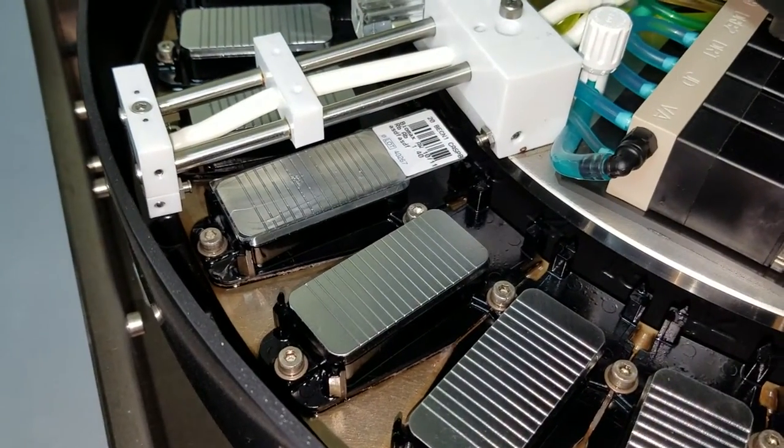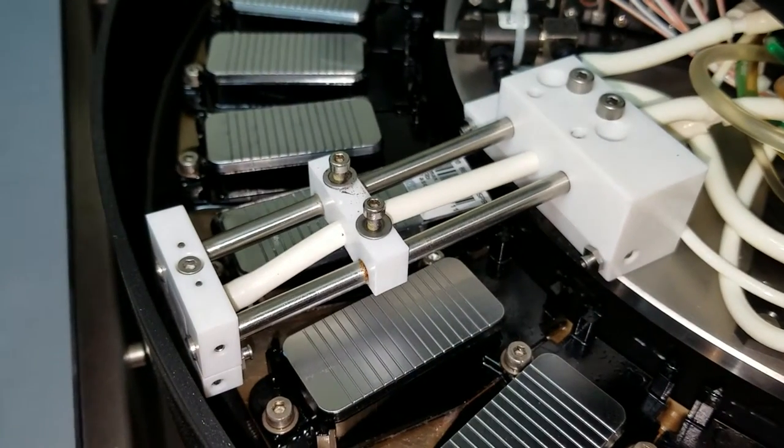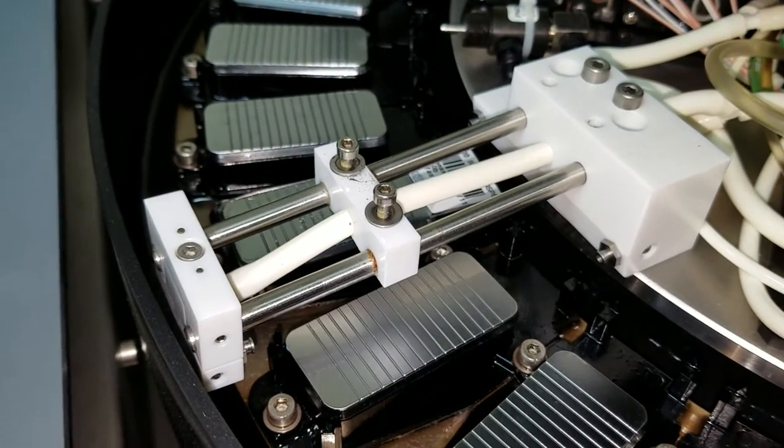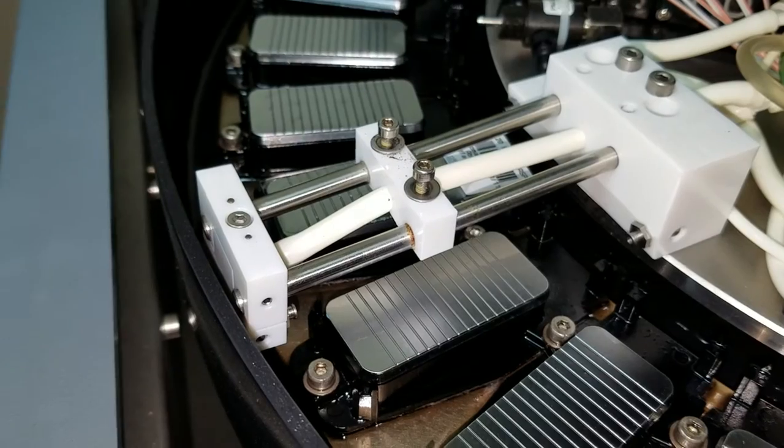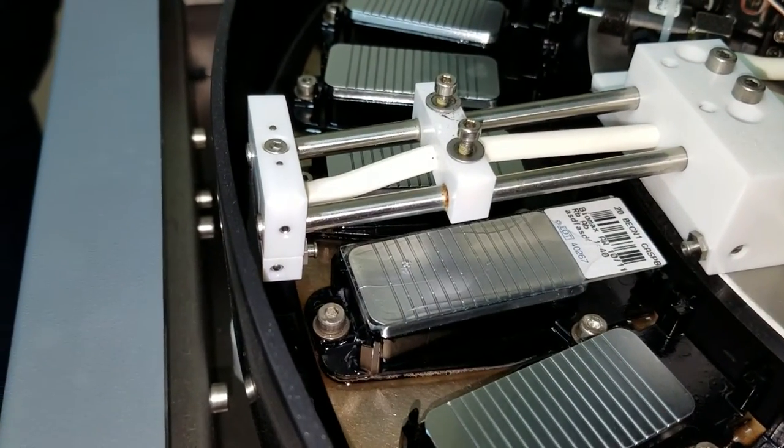So some people use the air vortex. Some people put a drop of Hematos on their light green so they can see the meniscus. Is this the air vortex? Yeah.